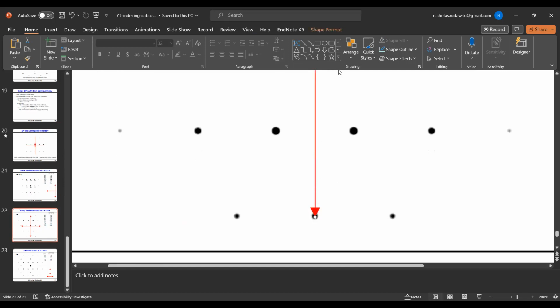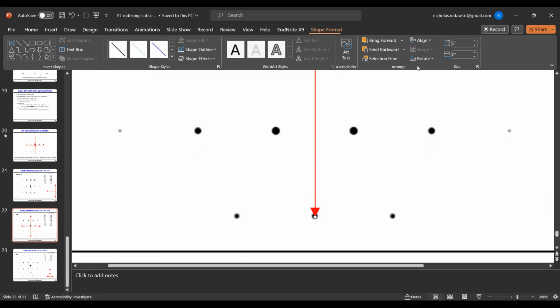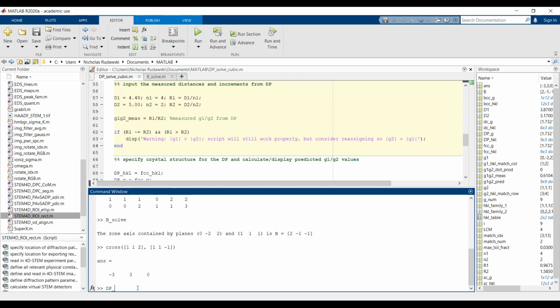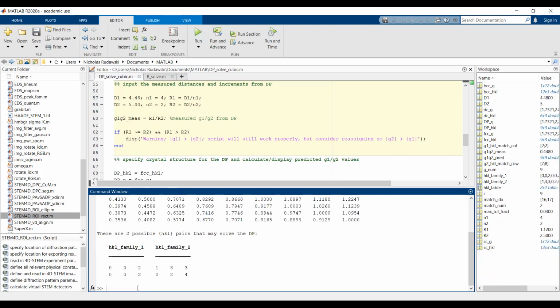Okay, what do we got here? Again, this zoom bar is in the way. 5 inches flat, okay? So that's over 2 increments. All right, let's run the routine here. Okay, and we only get 2 hits.